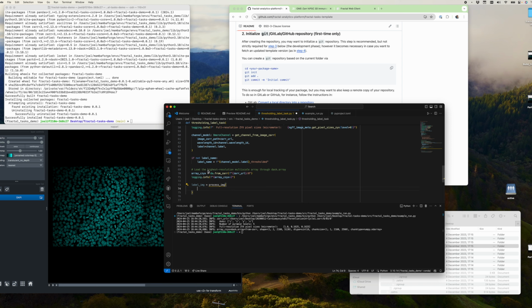And for that function, we will pass our actual array and we'll call compute on it to just create a NumPy image. This will work fine in this way for small images. If we have huge 3D arrays, we probably wouldn't want to process our whole array at once in this way, because now everything gets loaded into memory, so that can be somewhat inefficient.